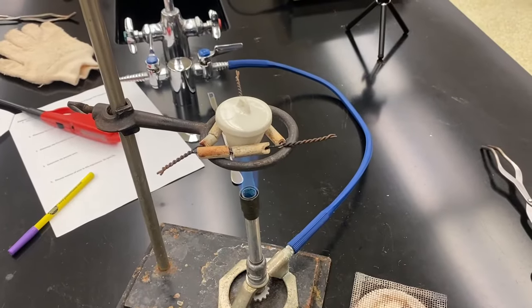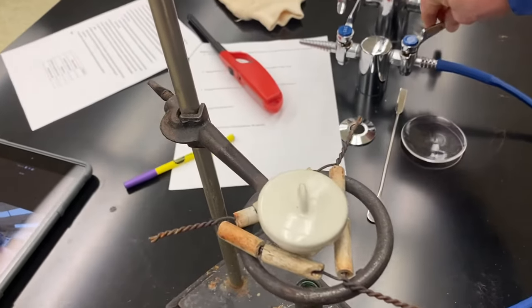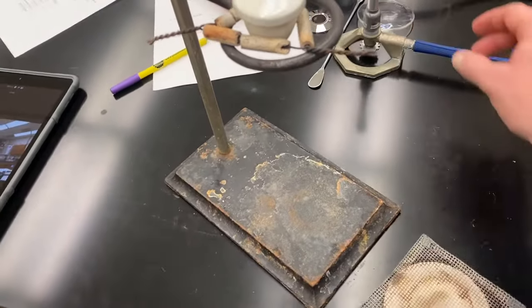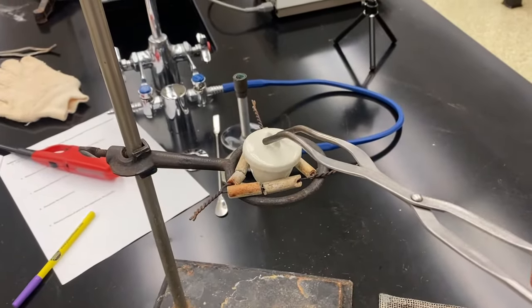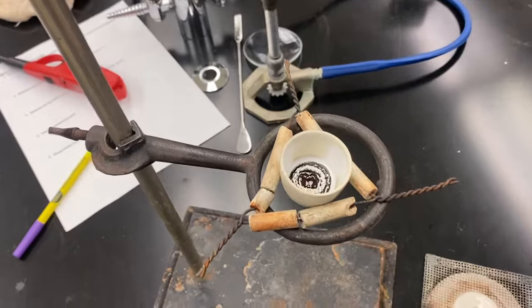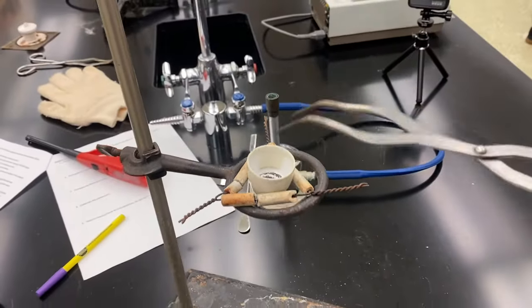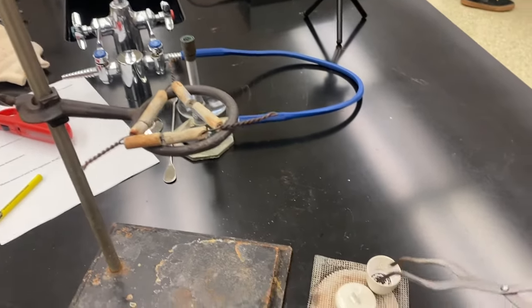We are finally at our 15-minute mark so I'm going to turn off the gas, remove my burner, and open the crucible and set the lid on the wire gauze. You can see we have a lot of magnesium oxide in there. I want to remove the crucible also to the wire gauze and let it cool for 10 minutes.